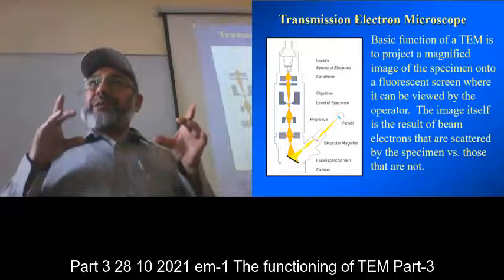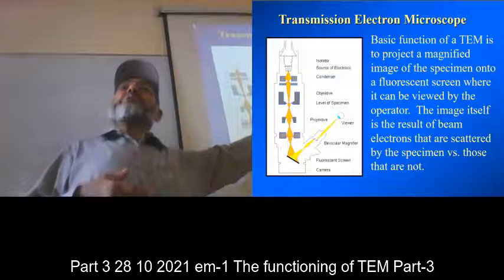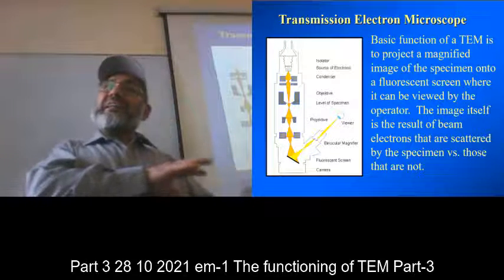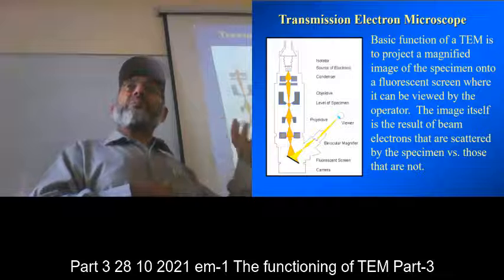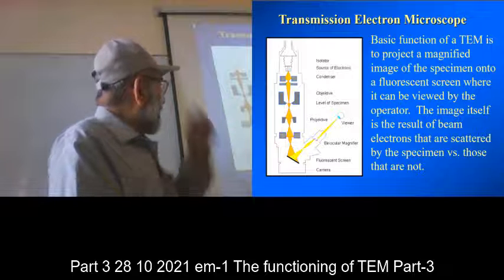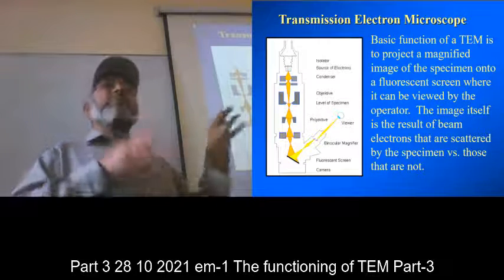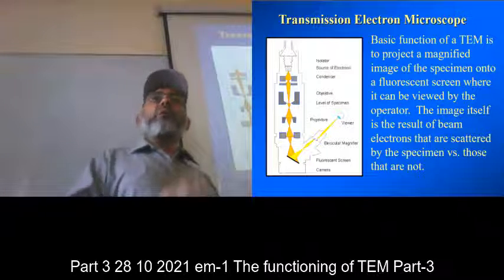after refining that beam and magnifying that beam, after the objective lens, you need something to direct that beam onto the fluorescent screen, and the lenses which do that job are called projecting lenses. Here is the diagram, what have they written? Projective. So this is probably some German writing, they are writing K instead of C, right? So the projective lenses then project that image or diffraction onto the viewing screen.